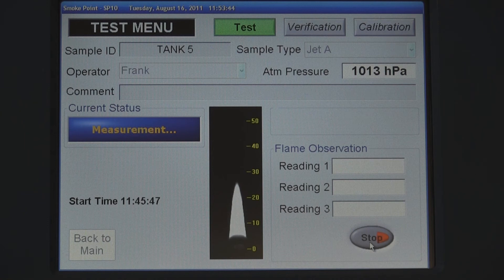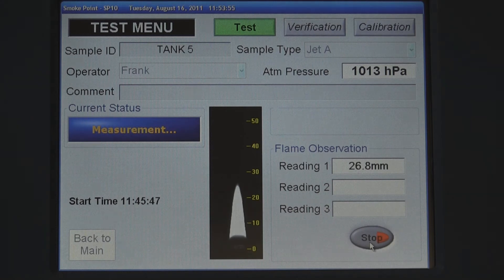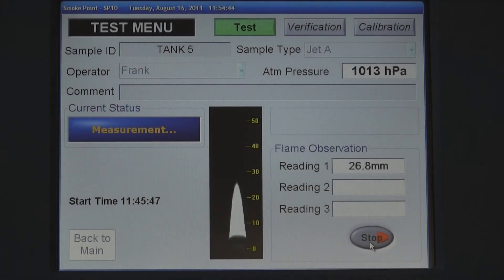Using a CCD camera with a resolution of 0.01 mm, the results are reported to one tenth of a millimeter. The first reading is 26.8 mm and the second reading is 27.0 mm.